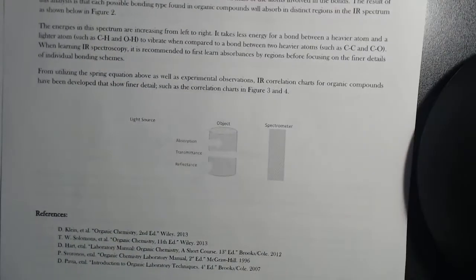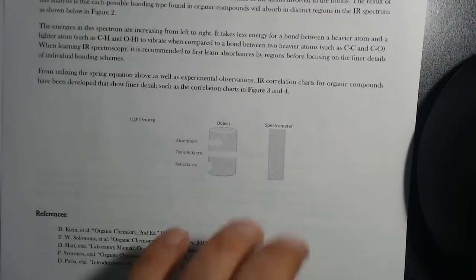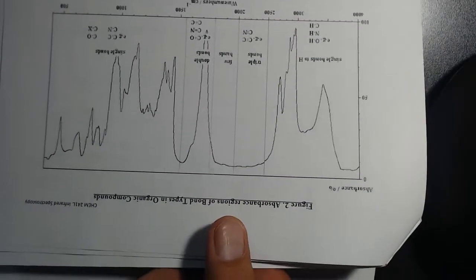There is a relationship between them. I purposely set the IR on this campus to show in absorption. So I want you guys to, every single lab, toggle transmittance, because I want you to understand there is a really close relationship between them. So what will happen is, oh look, we have transmittance, and then we want to go to absorb. It basically just flips it, so it'll mirror image the graph.